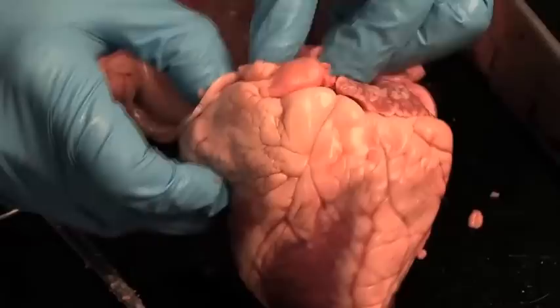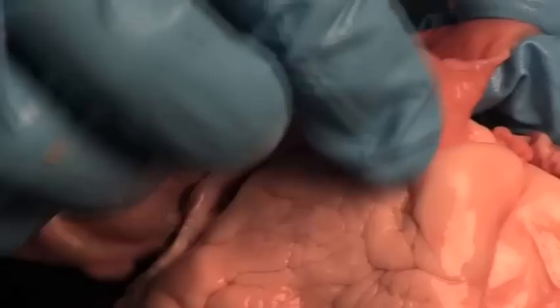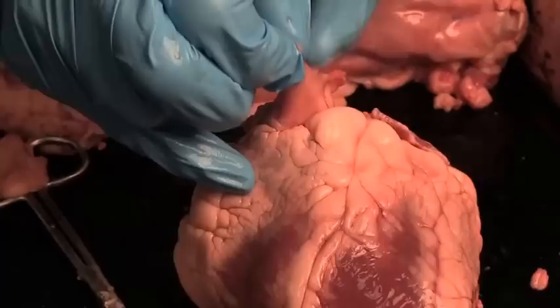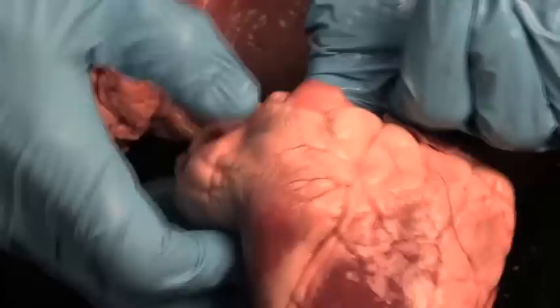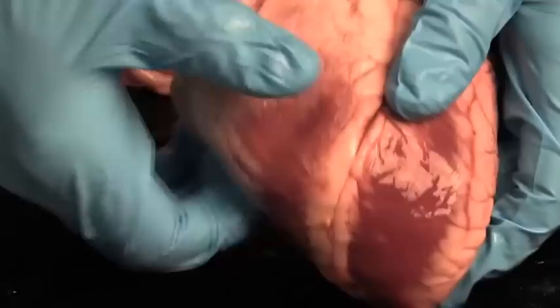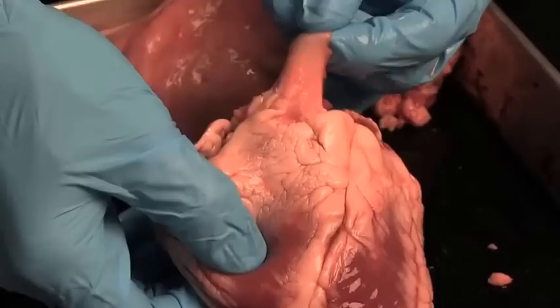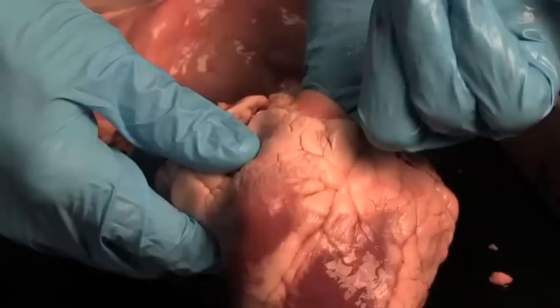The first thing I like to find when I'm looking at the heart is the pulmonary trunk, which is right here off the front. This vessel right here is what the right ventricle pumps blood to the lungs through, and it's got a pretty thick wall because it's an artery. If I stick my finger into the pulmonary trunk, you can see it goes into the right ventricle, which is right here. When I pinch the right ventricle, I notice it's got a pretty thin wall. So again, pulmonary trunk — this is what the right ventricle pumps blood out of to the lungs.